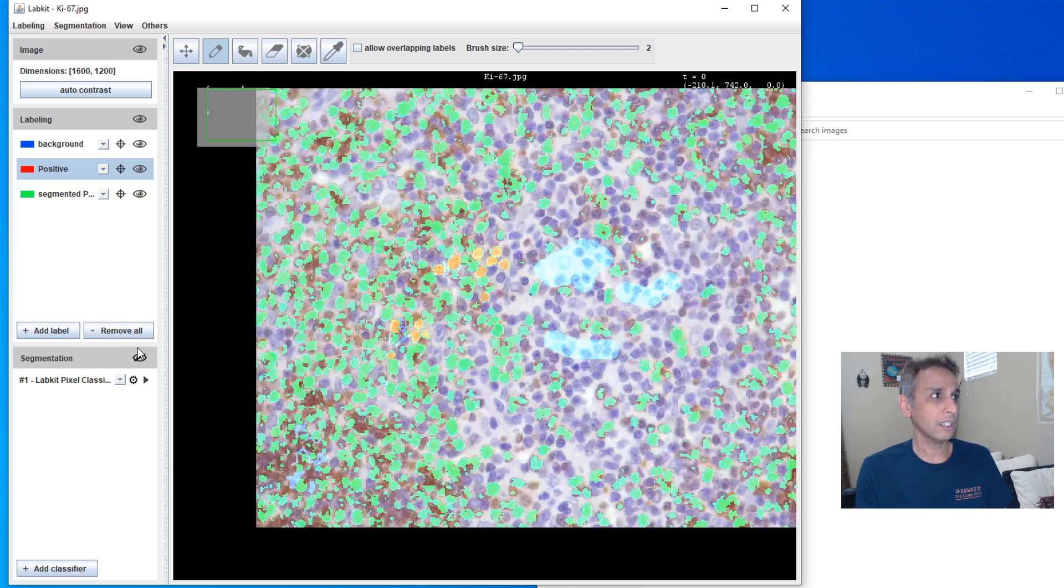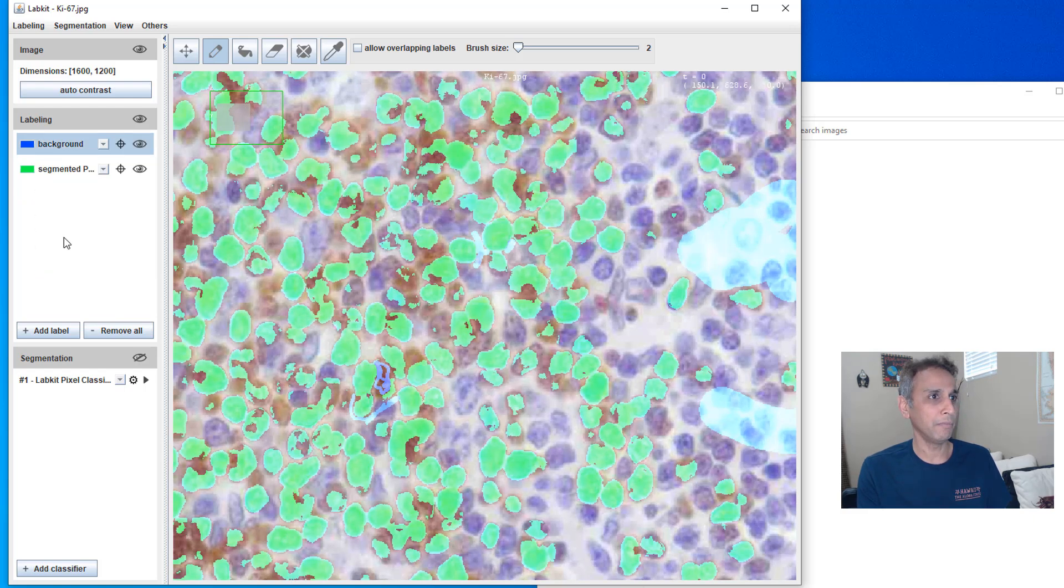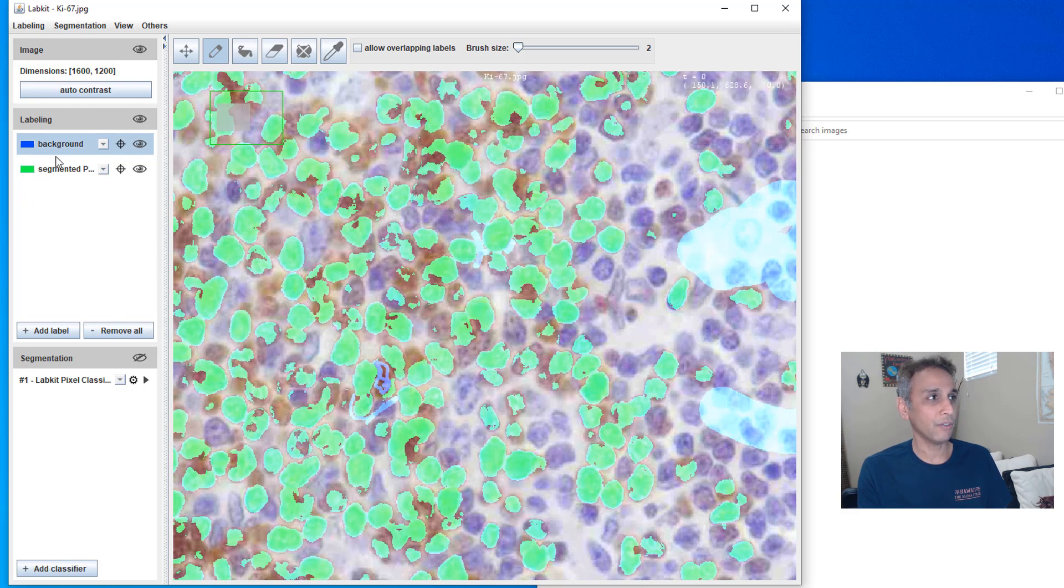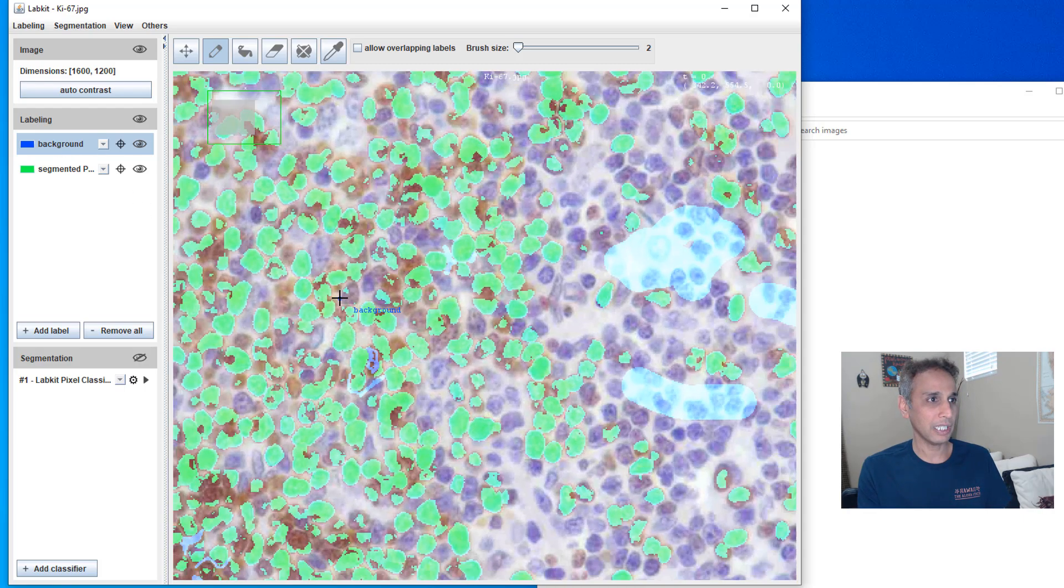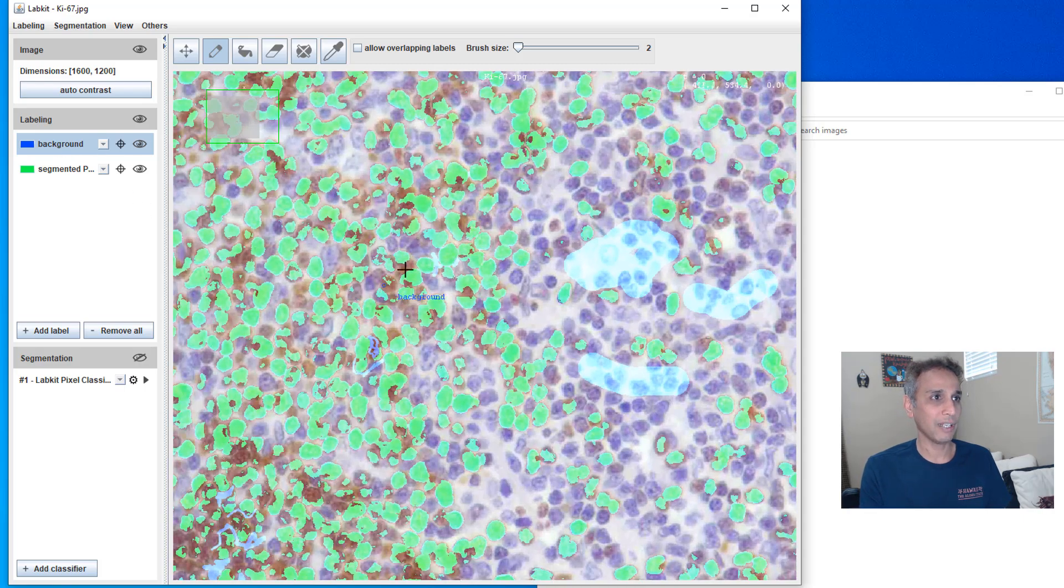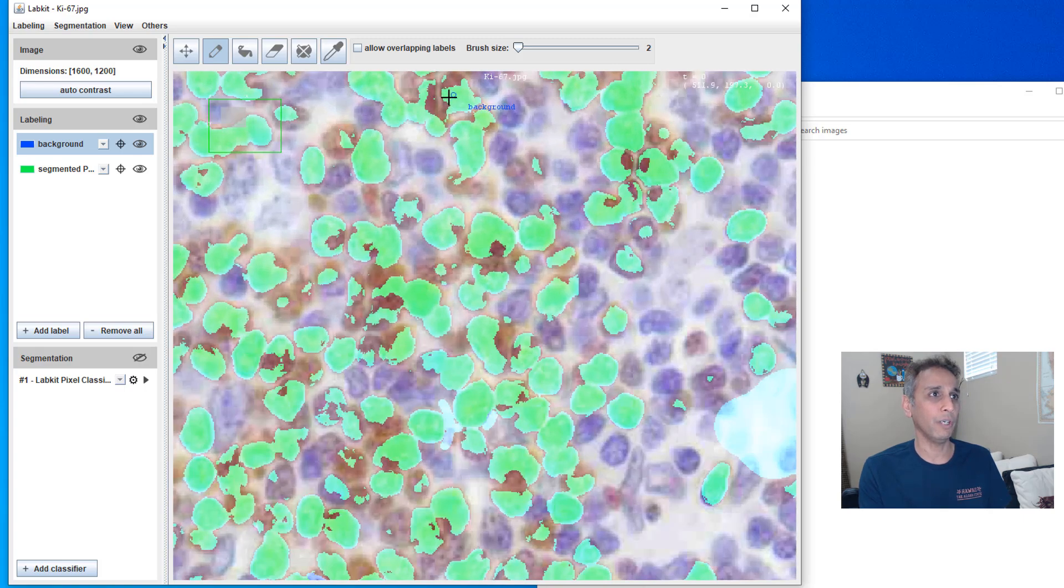So it's going to create now the mask right here. So let's turn everything off. Let's turn the positive off. In fact, let's remove the positive. I'm not interested in that anymore. You can remove background if you want. But now you can see how I have this class. You can further edit this if you want.